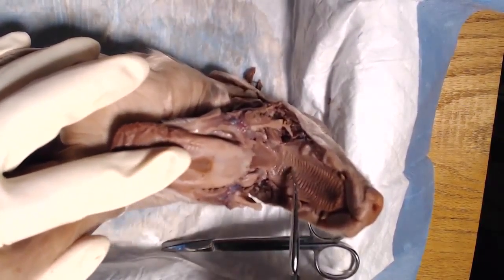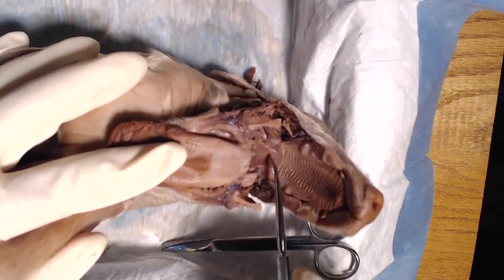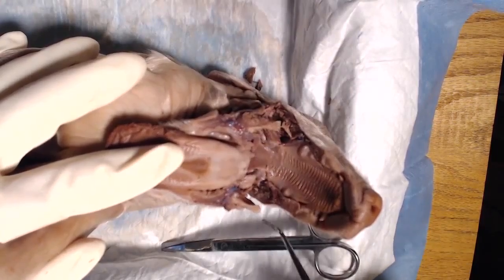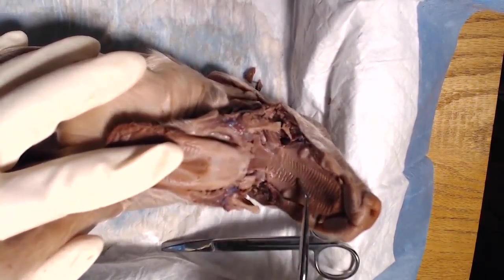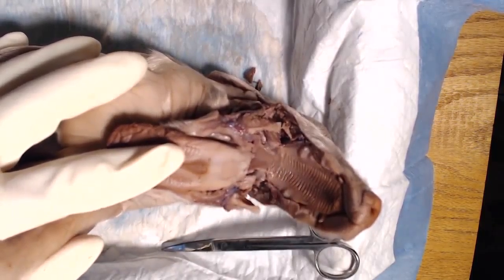And then just behind the hard palate, where those ridges stop, is some soft tissue right in here, and that's our soft palate. So you can definitely tell the difference between the hard palate and the soft palate. That's the roof of the mouth.